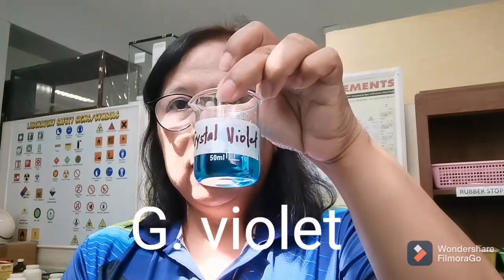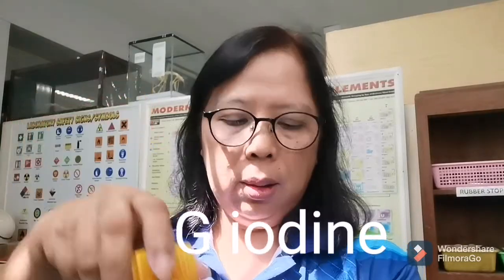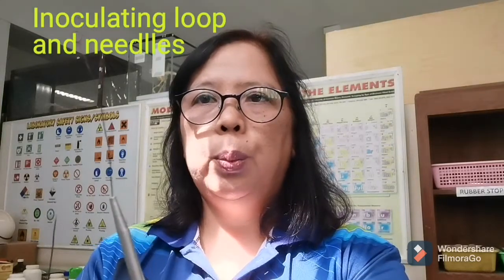The things that we're going to need include some chemicals. This includes your crystal violet, and then also iodine solution. Gram negative and gram positive analysis make use of iodine, and then ethanol, and then safranin, and of course we are going to make use of your inoculating loop.